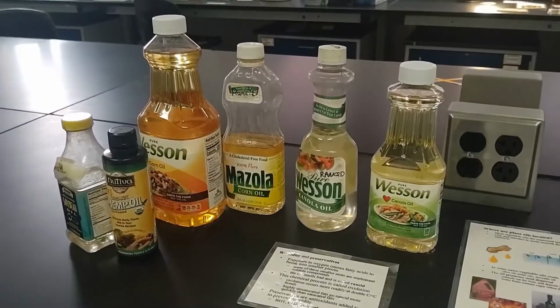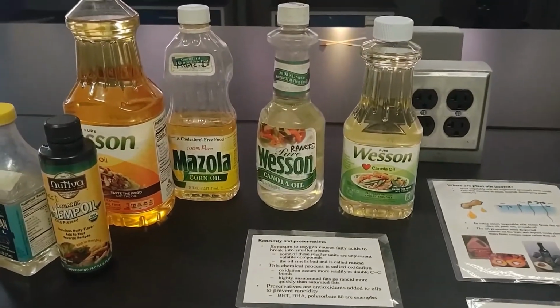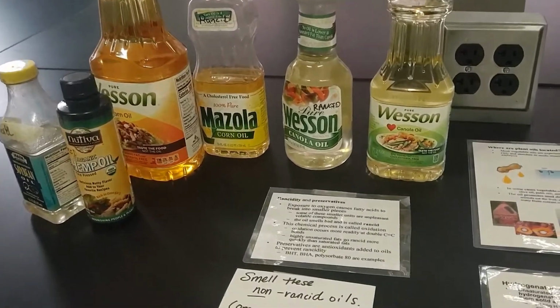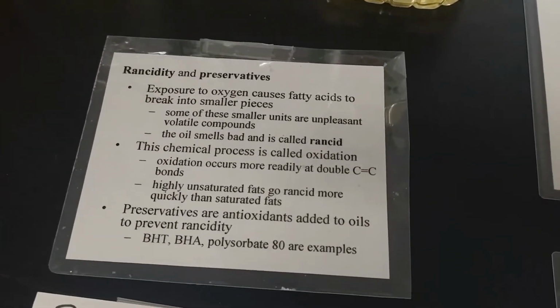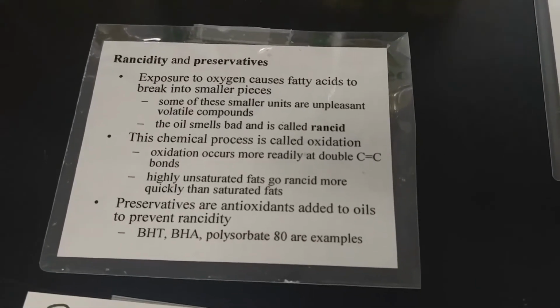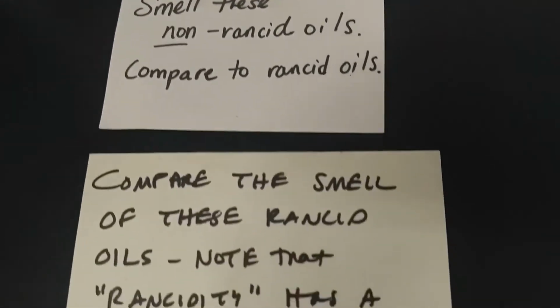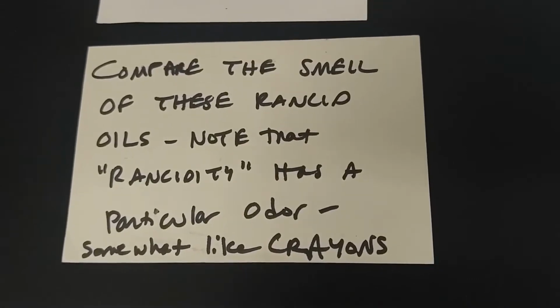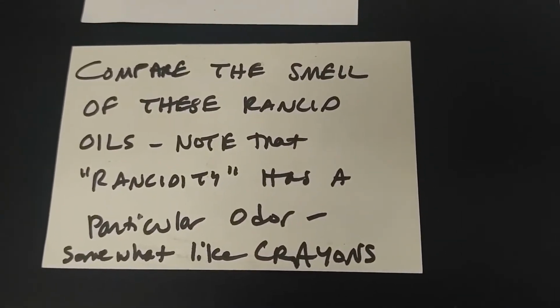Here we have some examples of rancid and non-rancid oils. Over time, preservatives need to be added to oils as they can break down. They can go through oxidation, which can break these molecules down and create an unpleasant smell. If you were to smell them, apparently the rancidity smells something like crayons. Whether you like the smell of crayons or not, that's up to you.